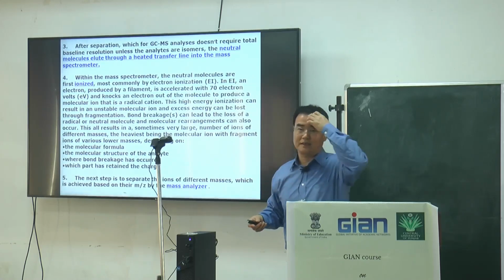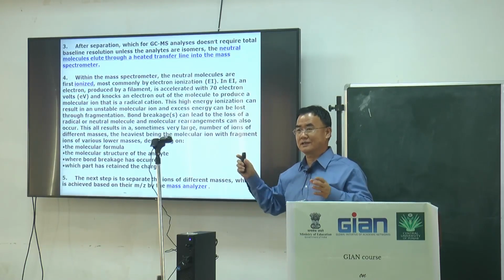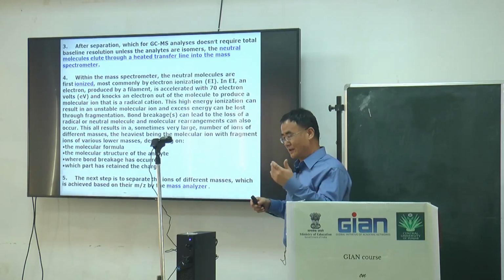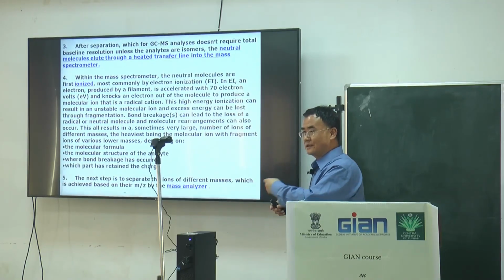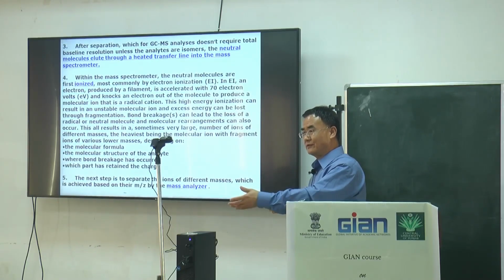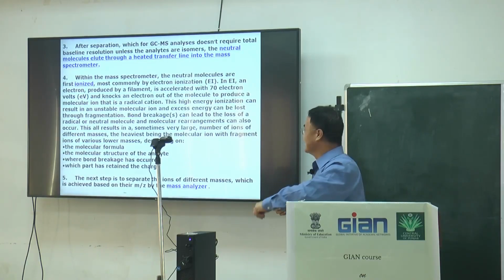And I think later on I will also use flavonoid analysis, which is very common. You can see it in the literature. I will take one or two examples, like besides lipids, those very complicated molecules, and also flavonoids, a very simple molecule.